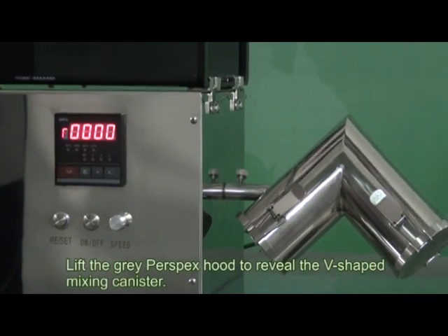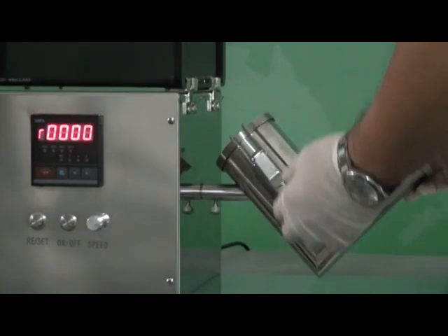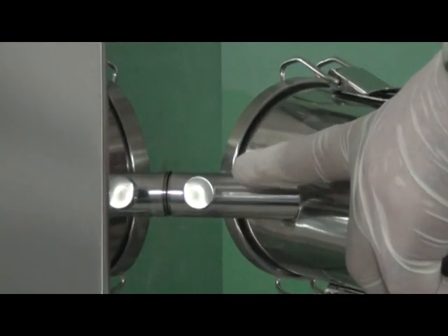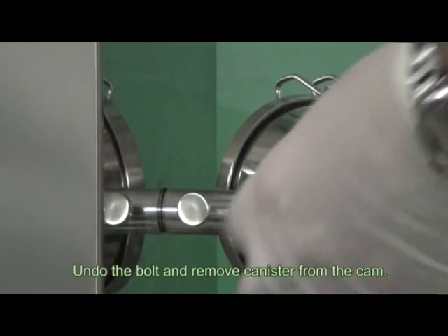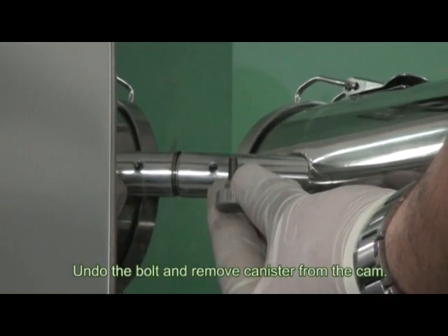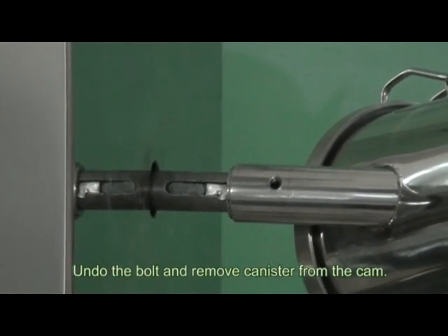Lift the grey power specs hood to reveal the v-shaped mixing canister. Undo the bolt and remove the canister from the cam.